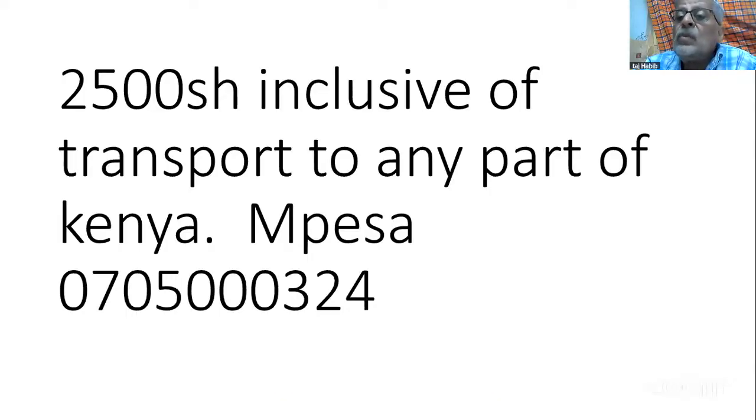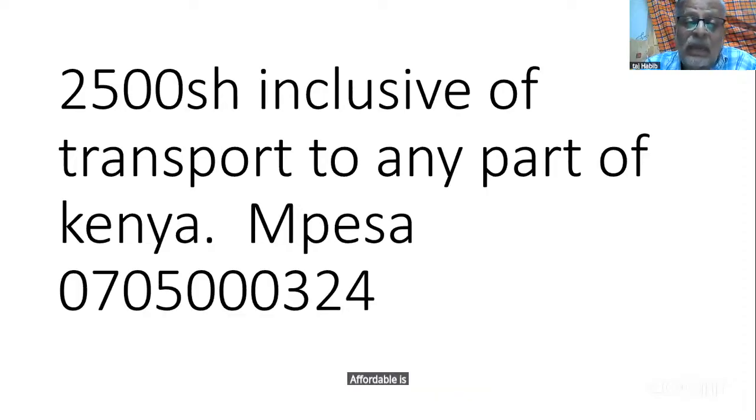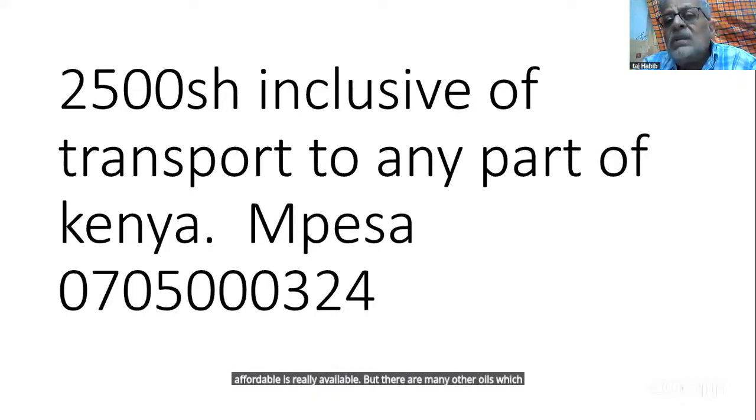It used to work very well because it is very safe to your fingers as compared to what is in the market today. It doesn't dry, and it is reasonably affordable and easily available. But there are many other oils which can be used. Even coconut oil can be used.